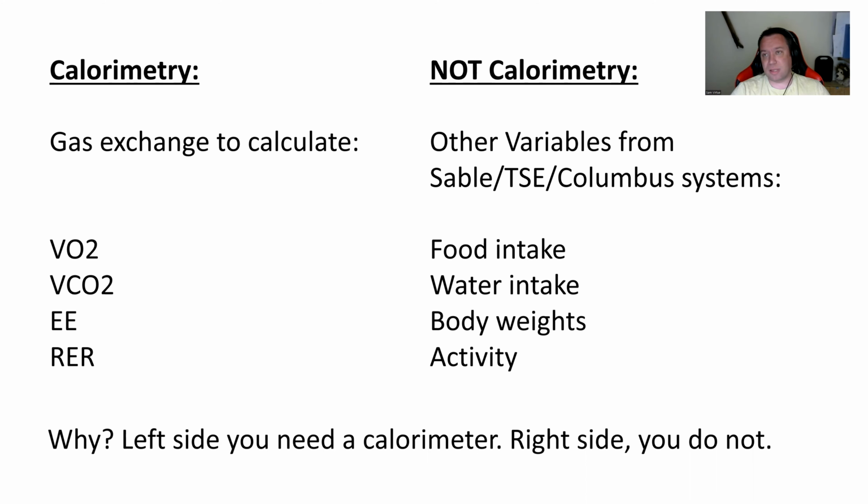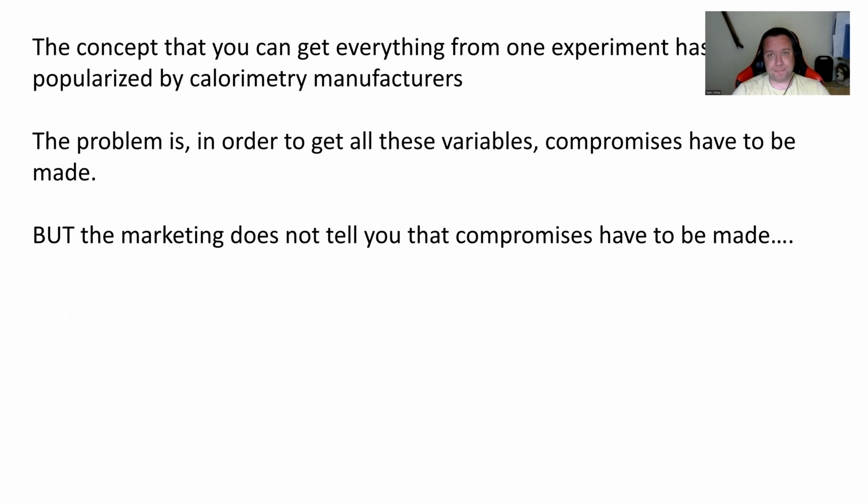And it may be worth thinking about whether you want to get really good energy expenditure data, really good RER data, versus getting everything in one experiment. And in an idealized world, and when these systems work perfectly, you can do it. But when they don't, then that's when you run into a potential problem.